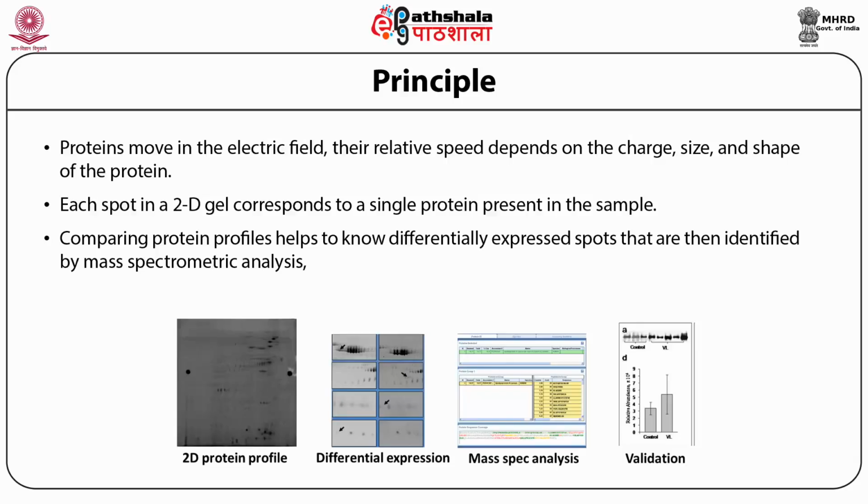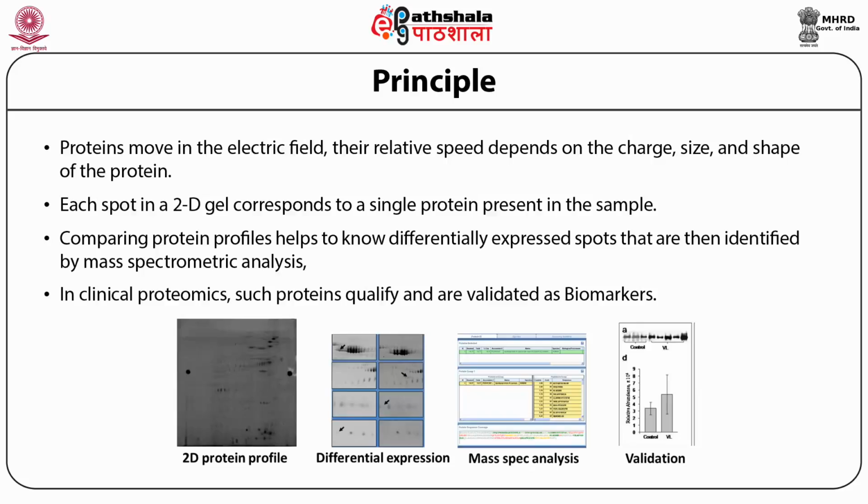And having identified the sample, we then go for a validation because it's a population based study, and the validation could include experiments like Western blot, ELISA, immunohistochemistry, and cDNA expression profile. This way, we are in a position to identify potential novel biomarkers or drug targets.